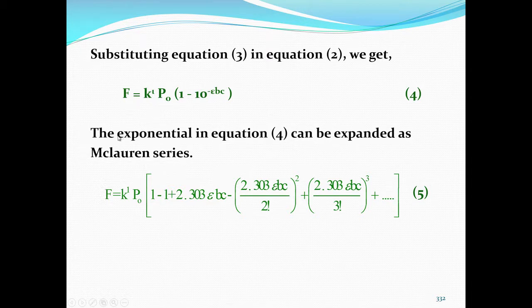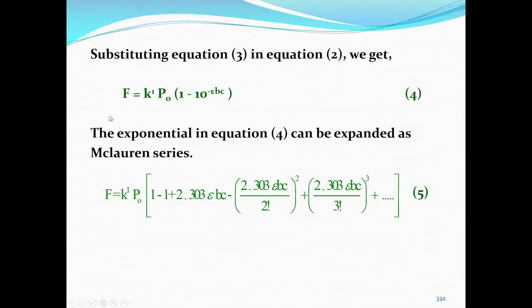Now, mathematically I can treat this as an exponential equation and expand it. There is a simple expansion process for this, that is known as the Maclaurin series. You can look up your first year engineering mathematics or any mathematics book, and you can see that 1 minus e to the power of x, or 10 to the power of x, can be expanded something like this.